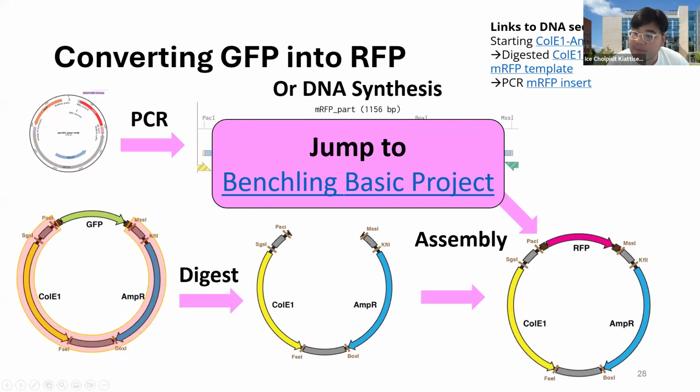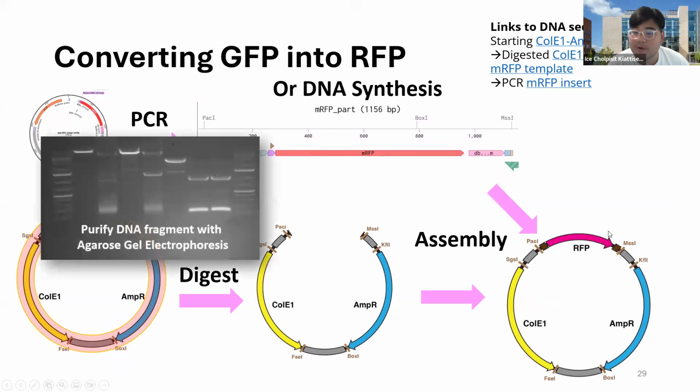I'm going to go back to the presentation and get into the other scenario again. So after you have that, you actually purify your DNA, right? This is one example of my gel where I did digestion.